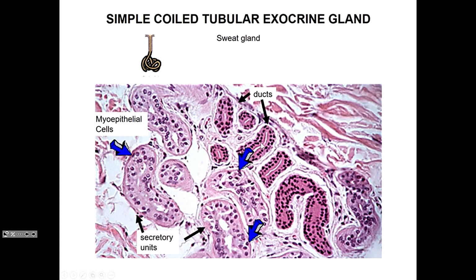So you know, because it's a merocrine sweat gland, it is simple coiled. All right? Simple coiled tubular. So identification of this epithelium actually tells you what you're looking at, and then you remember, oh yeah, sweat gland, merocrine sweat gland. So like I said before, sometimes look for other things that can give you a hint as to what you're really looking at, and then that can clue you to the answer that you're looking for.